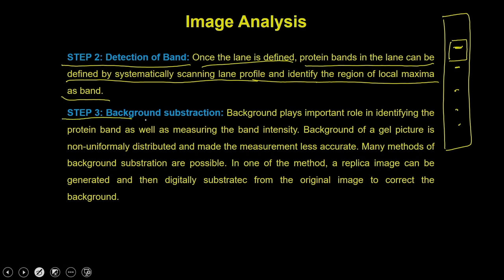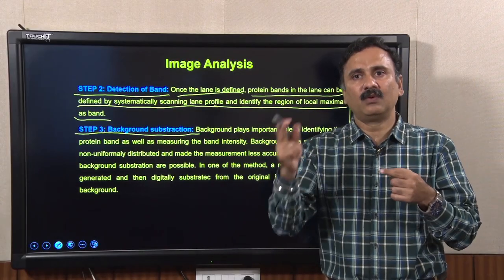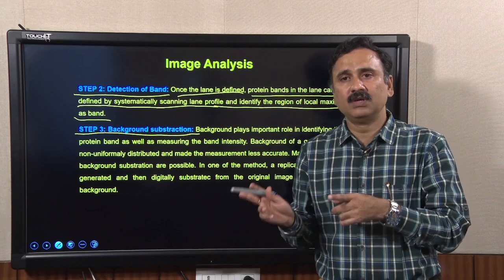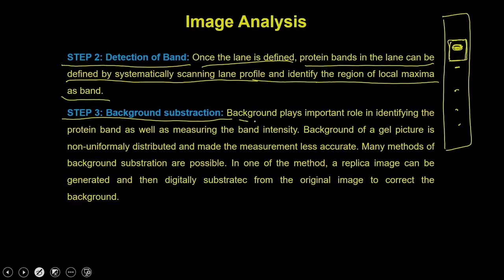Then step 3. Step 3 is that you have to do the background subtraction. So once you select the band, you are not only going to select the band, but you are also going to select the neighboring background. That background has to be subtracted from your protein band so that you get the absolute intensity of that particular band. So the background plays an important role in identifying the protein band as well as measuring the protein band intensity.